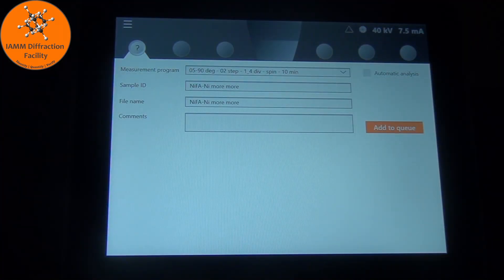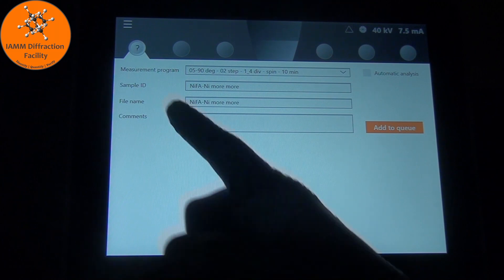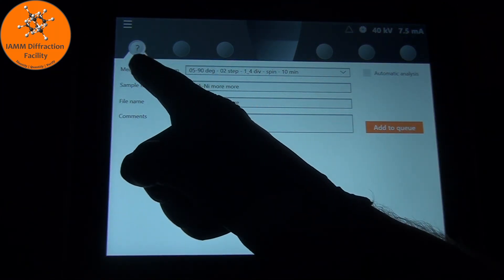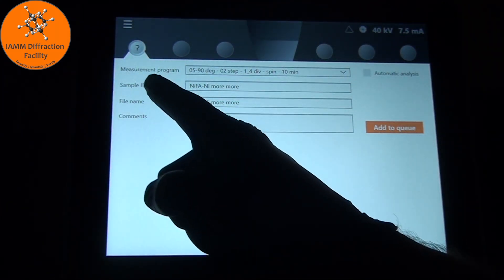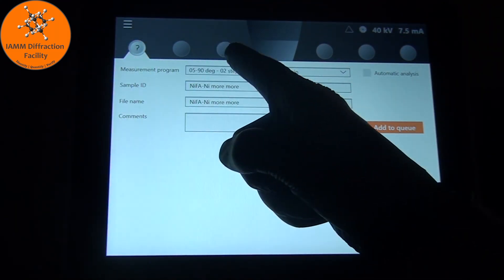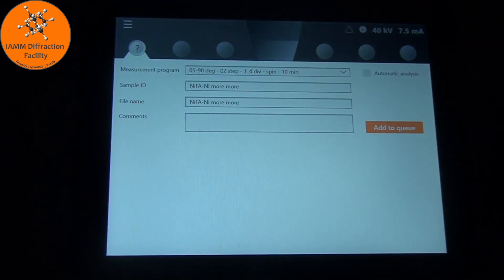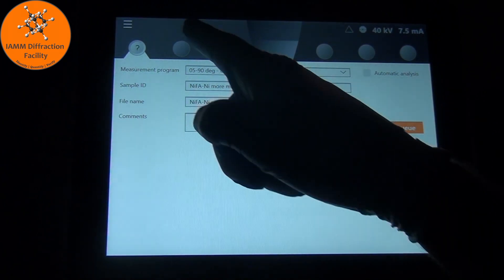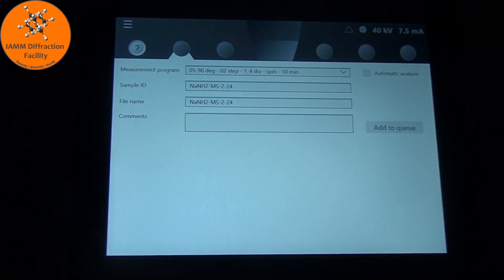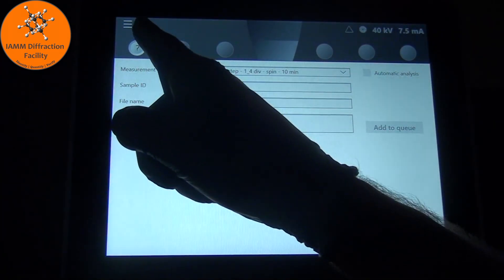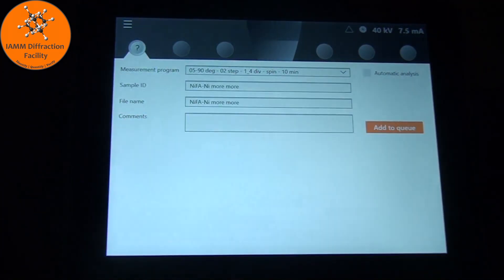Had I placed a sample in a different sample position, this little question mark would have appeared in one of these other circles, and we would just touch that circle to go to that position. Let's go back to our first position.